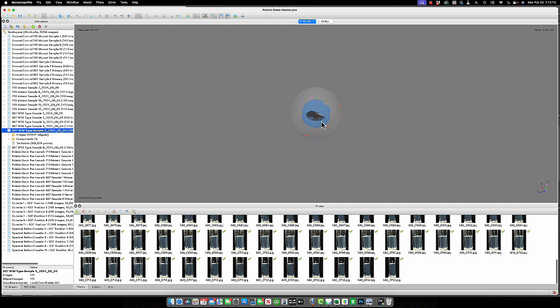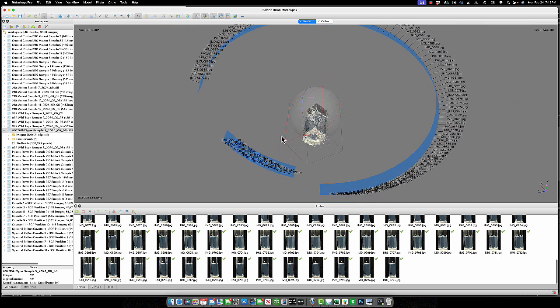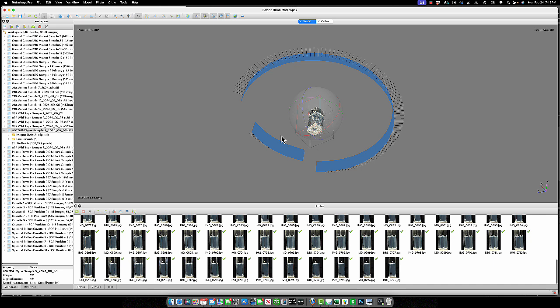We're zooming out first, but you can see some of the images over here in the back are kind of misplaced. So I just need to double check why that is, and then we can run it again. But yeah, for the most part, that's a much better result than I was getting. So good news there. So I'm going to do the same sort of process with these other 3, and then rerun it, and then I think I'll actually be okay.